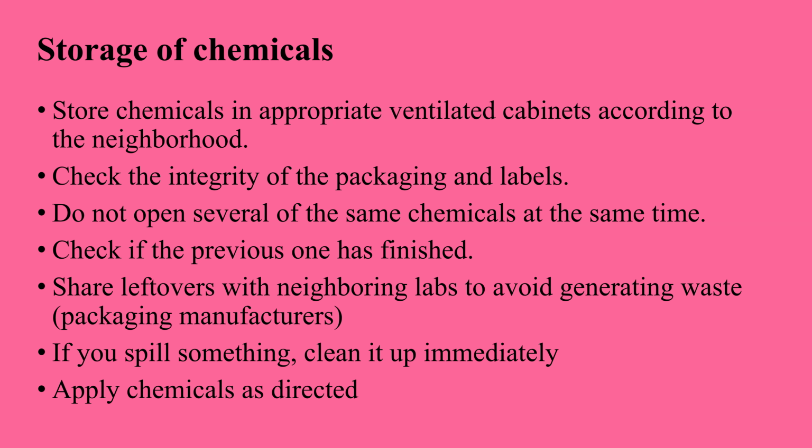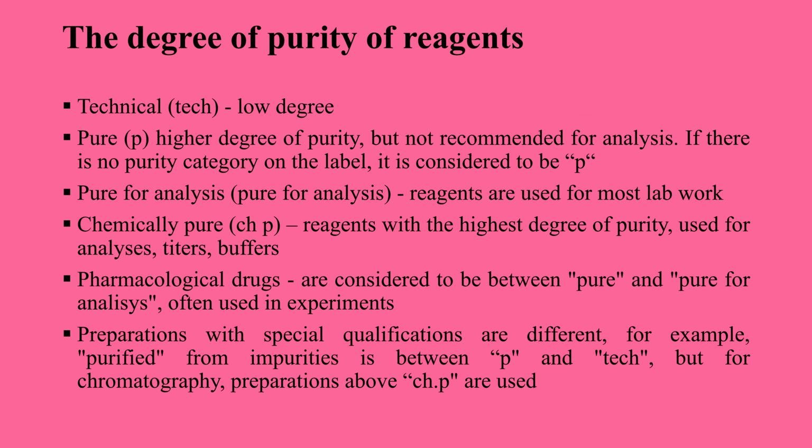You should apply chemicals according to protocol. Of course, this information is based on our local post-Soviet classification, so I'm not sure if European labs have a similar classification, but it's for your information.